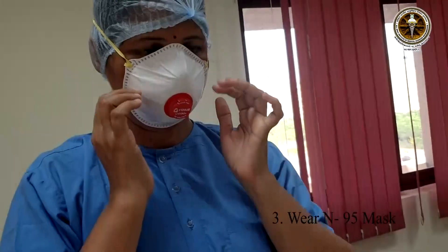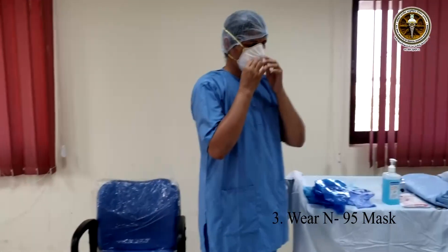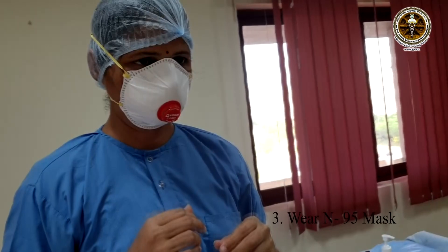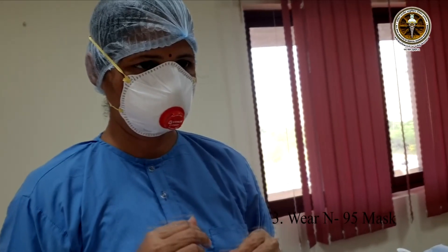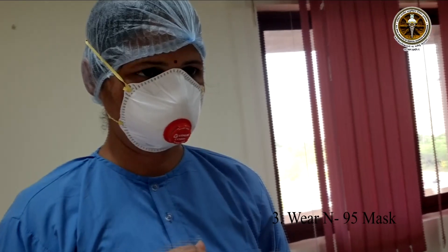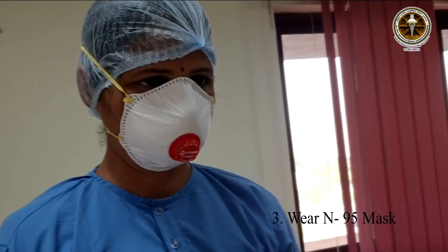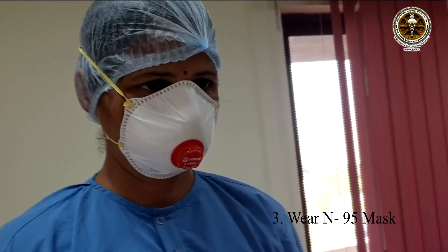Now, fit test. The negative fit test can be done by taking multiple deep breaths — look for dimpling of the mask. The positive fit test can be done by blowing air out while holding two fingers over the mask. Look for any significant air leak.